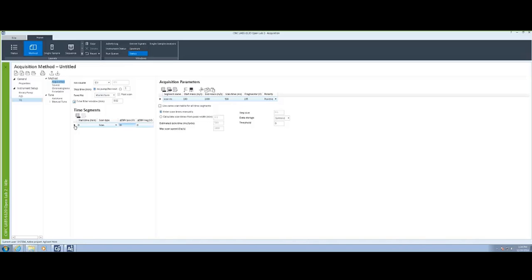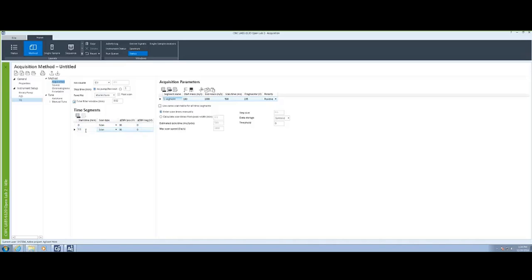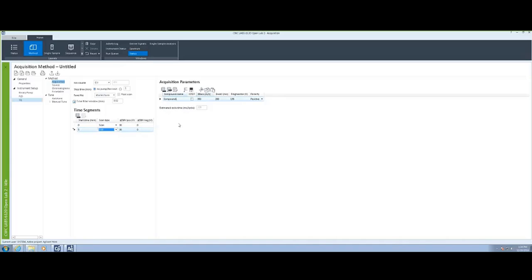Additionally, on my time segments in the center area, if I would like to scan first from 100 to 1,000, starting at time 0, I'm going to call that a particular signal name. Then, when I get to 5 minutes, I want to change over to SIM and collect simply a SIM signal, and I will change that to 350.